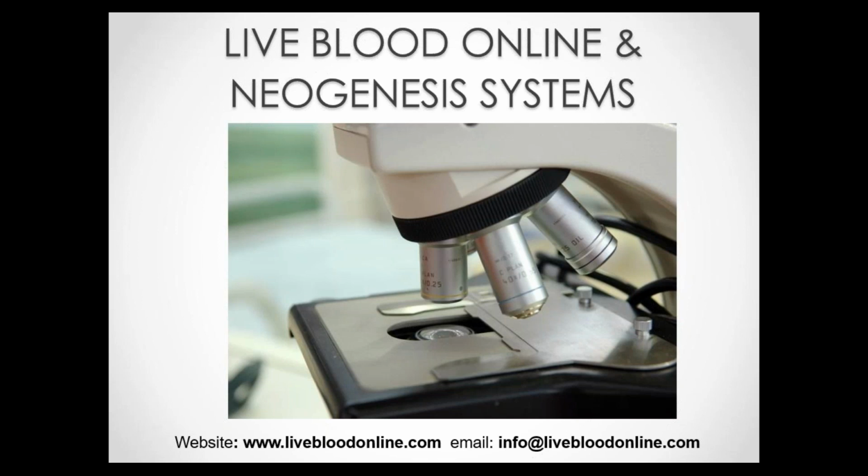But there are also some very fundamental differences. The fact that we're looking at live blood makes a very big difference. In conventional hematology, the blood is, of course, drawn from a vein. It's placed in a little test tube with an anticoagulant, and then the blood is sent off to a laboratory where a different technician will actually look at the blood under a microscope. But before analyzing the blood, they stain the sample and basically kill all the blood cells to preserve the sample.